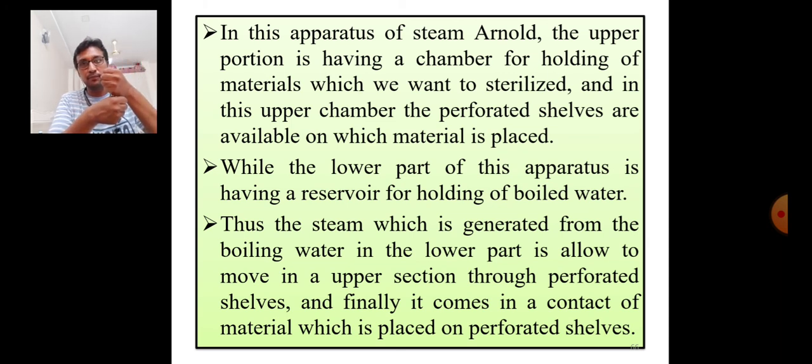And we are closing that particular upper chamber. Okay. In this upper chamber, the perforated shelves are there. The shelves have holes on their surface, perforated in nature, and we are placing the material which we want to sterilize on these shelves.